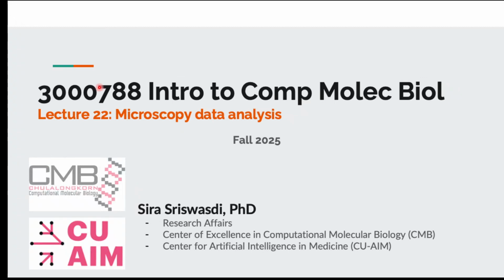Okay, so today is our 22nd lecture. So we are going to talk about microscopic data analysis in the sense that so far we have seen omics data, but we haven't seen imaging data yet. So in this lecture, we are going to go over what kind of imaging data we see in biology and how do we extract information from image and what are computational tools or techniques that will help us make quantitative assessment of image in biology.